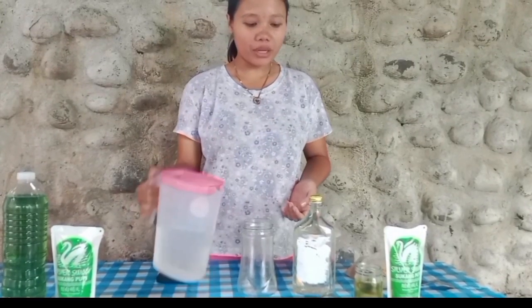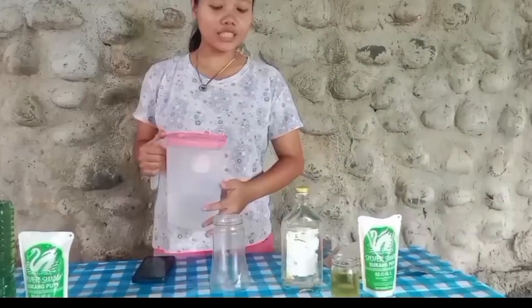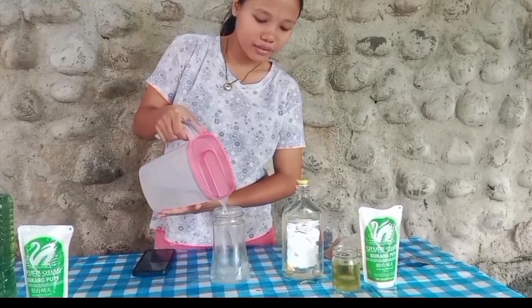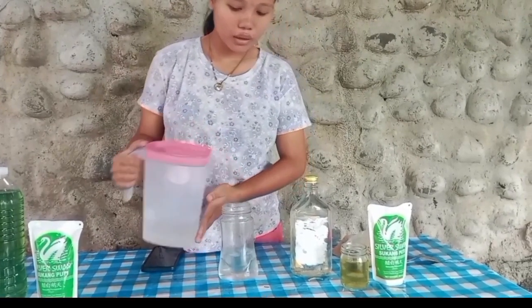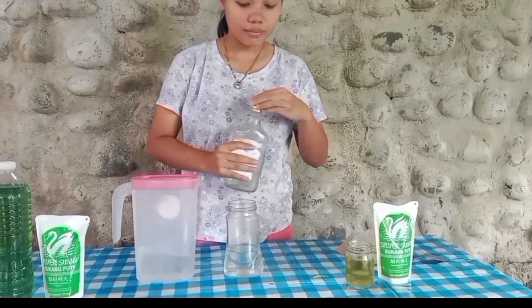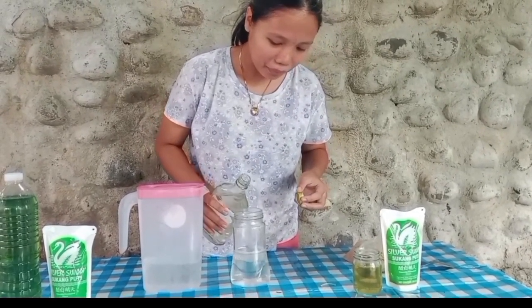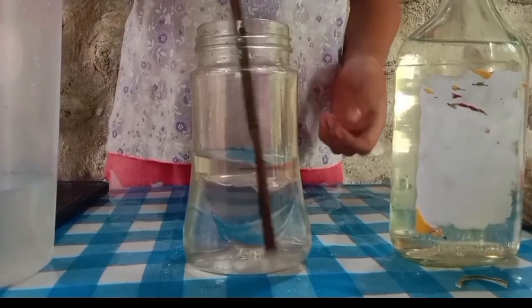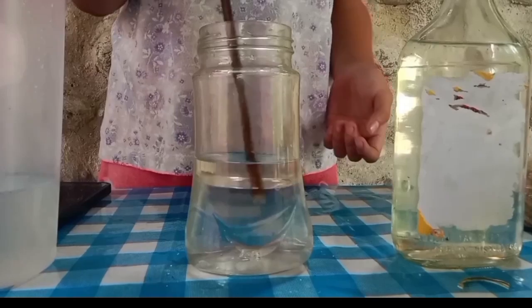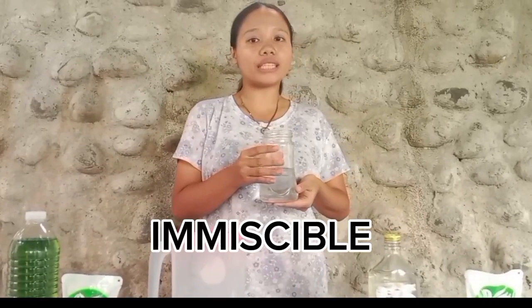So next is the combination of water and kerosene. So let's mix together. Pour the water. Also the kerosene. Let's mix together. We observe that the two liquids do not mix. Water is polar and kerosene is non-polar. They are both immiscible liquids that cannot mix together.